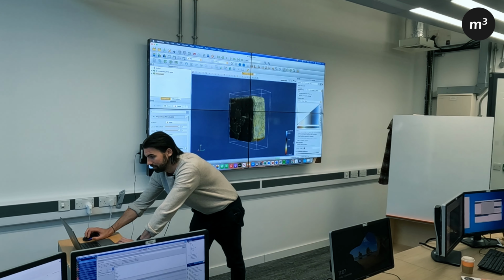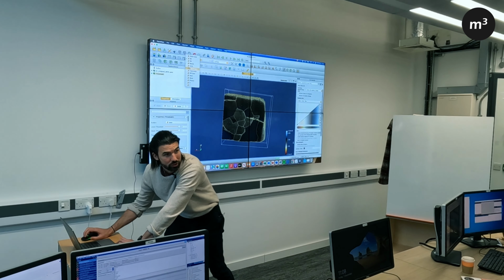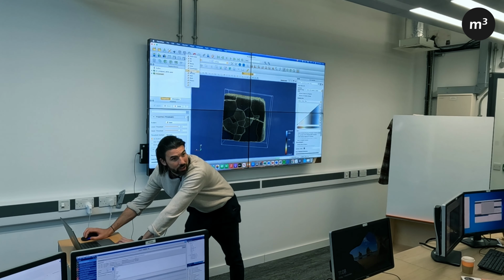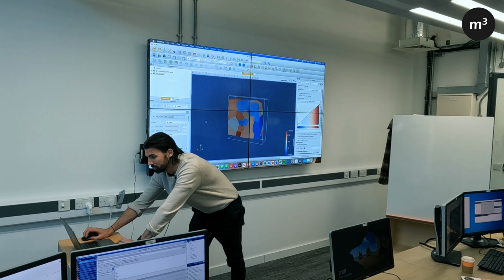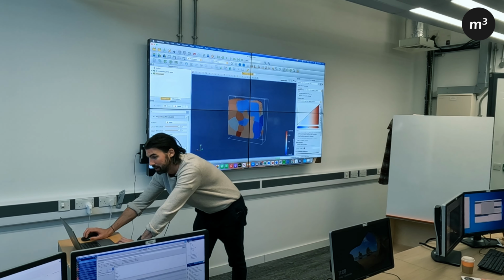Just select whatever you like for that. That's pretty cool. And then we can now color the 3D volume for any of our attribute arrays we have on our cell data, which is pretty cool. So now we have a unique feature ID because we've run the segmentation filter. We can color these for feature ID, and this will basically randomly color them according to the number of the feature ID.